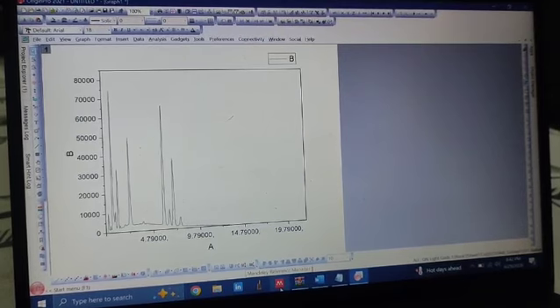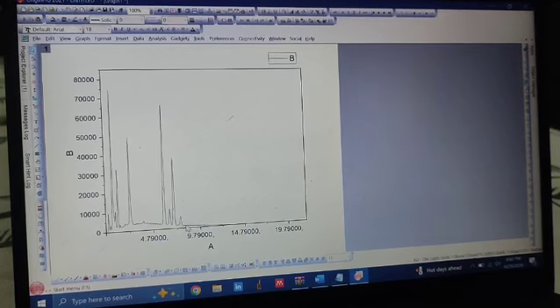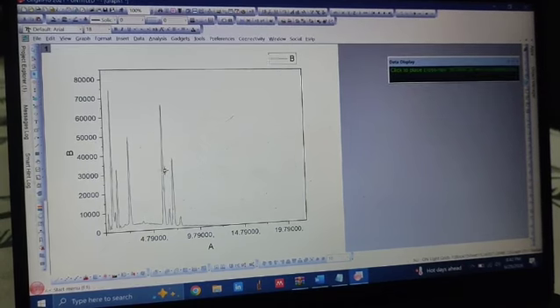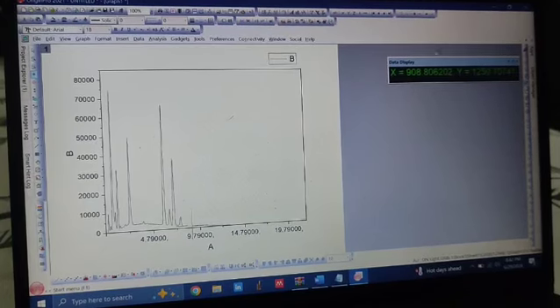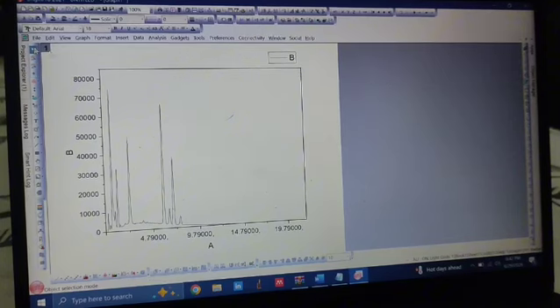And after that, as you can see, there is an empty space on the graph where there is no data. To remove this, use the data reader and identify the maximum values. For example, it's around 900 kilo electron volt. Now double click on the x-axis to modify that.